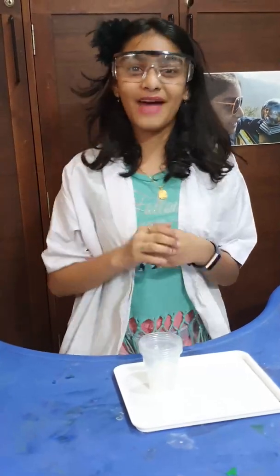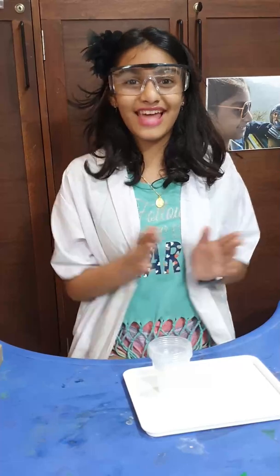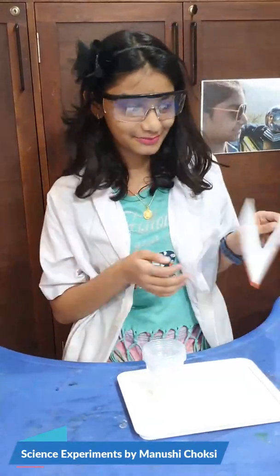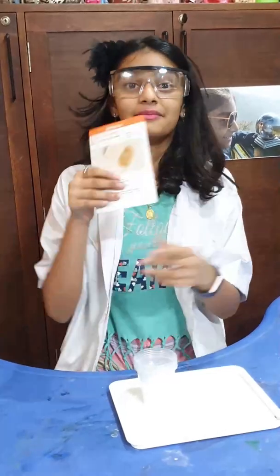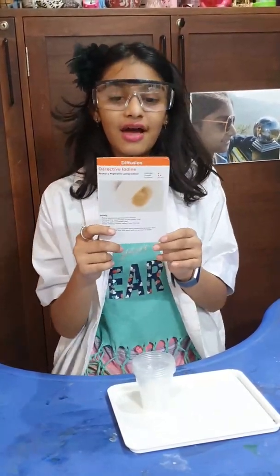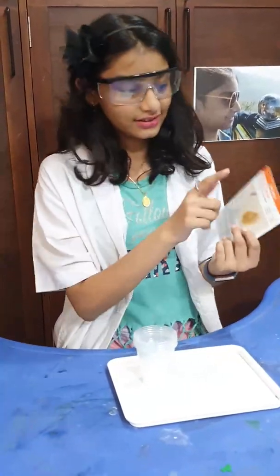Hey guys, I'm back with another video and today I'm going to do a science experiment — I'm really excited! Today I'm going to do iodine detective, using iodine from the same kit as the chemical reefs video.